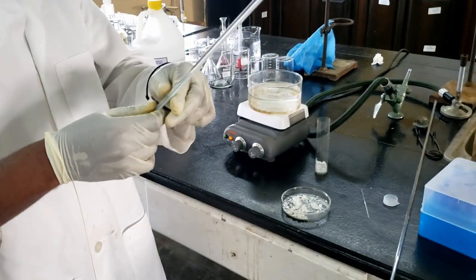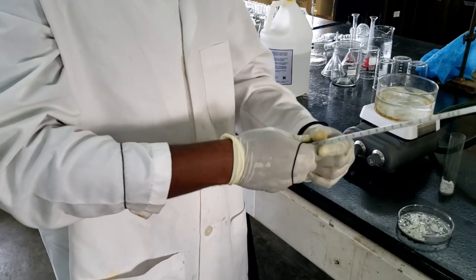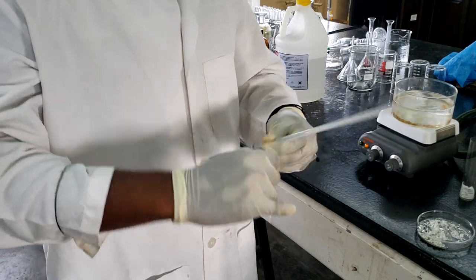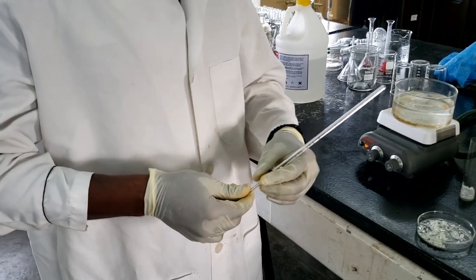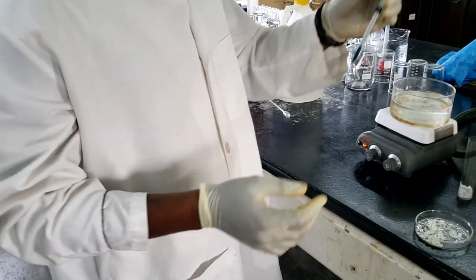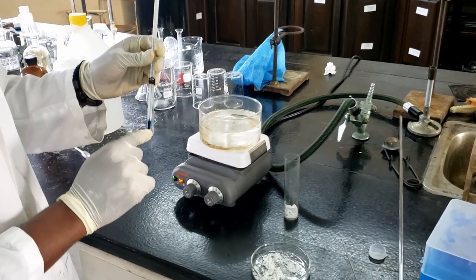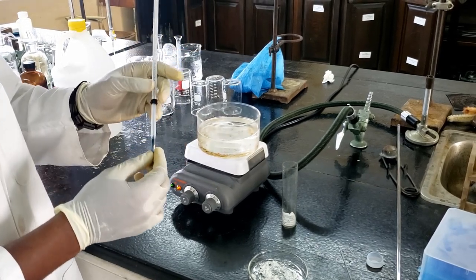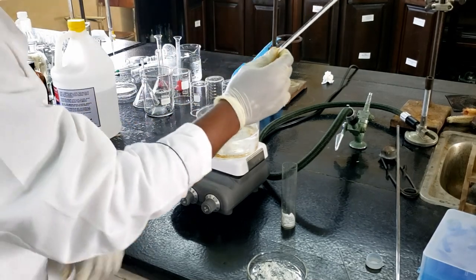We get a normal thermometer and a rubber band, and we just attach that tube to the thermometer. And what we're then going to do is lower this into the hot water bath, and while simultaneously observing the solid inside the tube and the temperature, we're going to find out at what temperature that solid melts. So you'll just see when the solid liquefies, and we're going to read off the temperature at which it occurs.